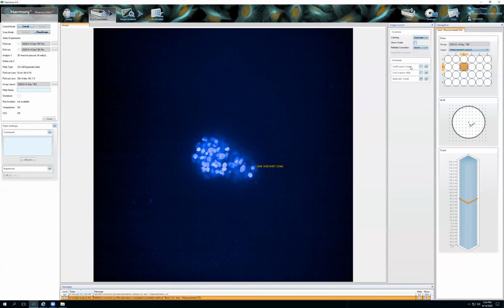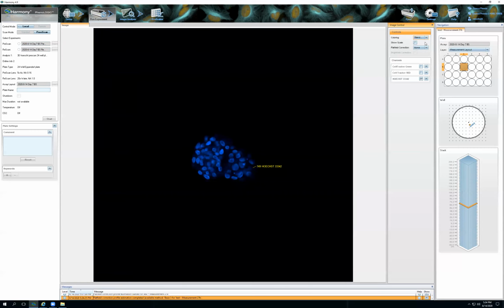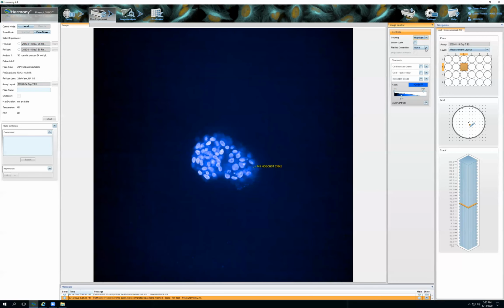The other thing to keep in mind too is, let's go towards the middle here. So this is in highlight view. There's enhanced and there's standard. And as you can see here, this is the min, the gamma, and the max. This is just what you see. So the different settings are kind of like preset settings, but you can change any of these.